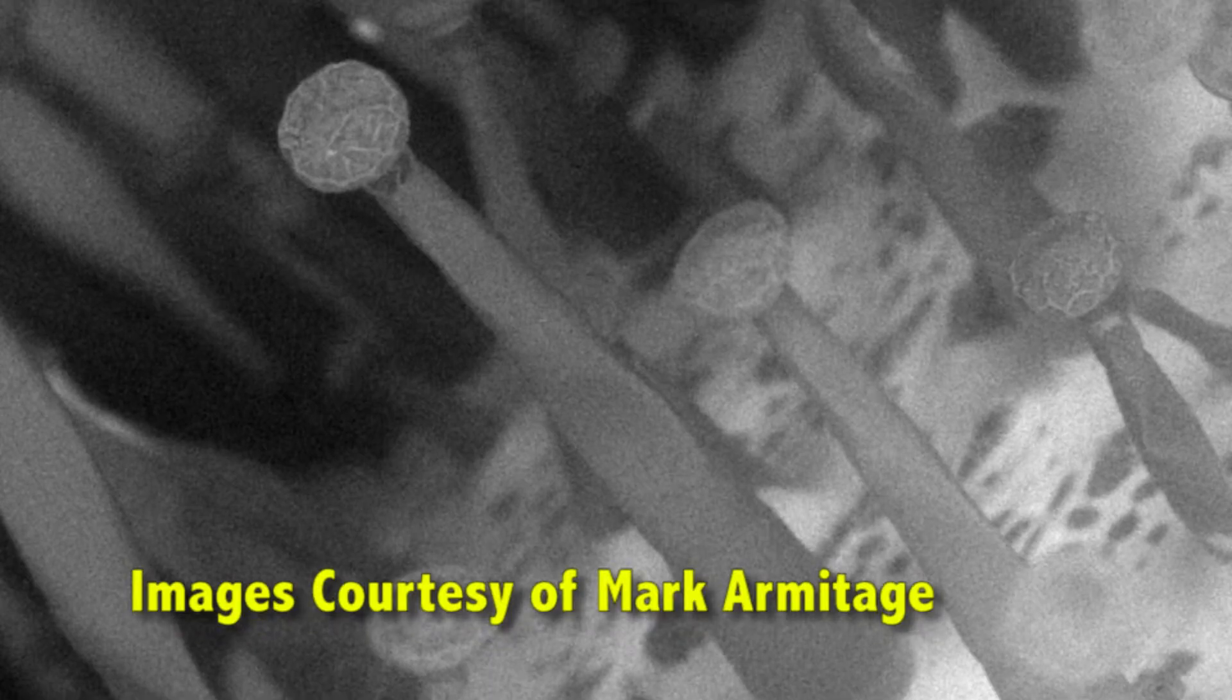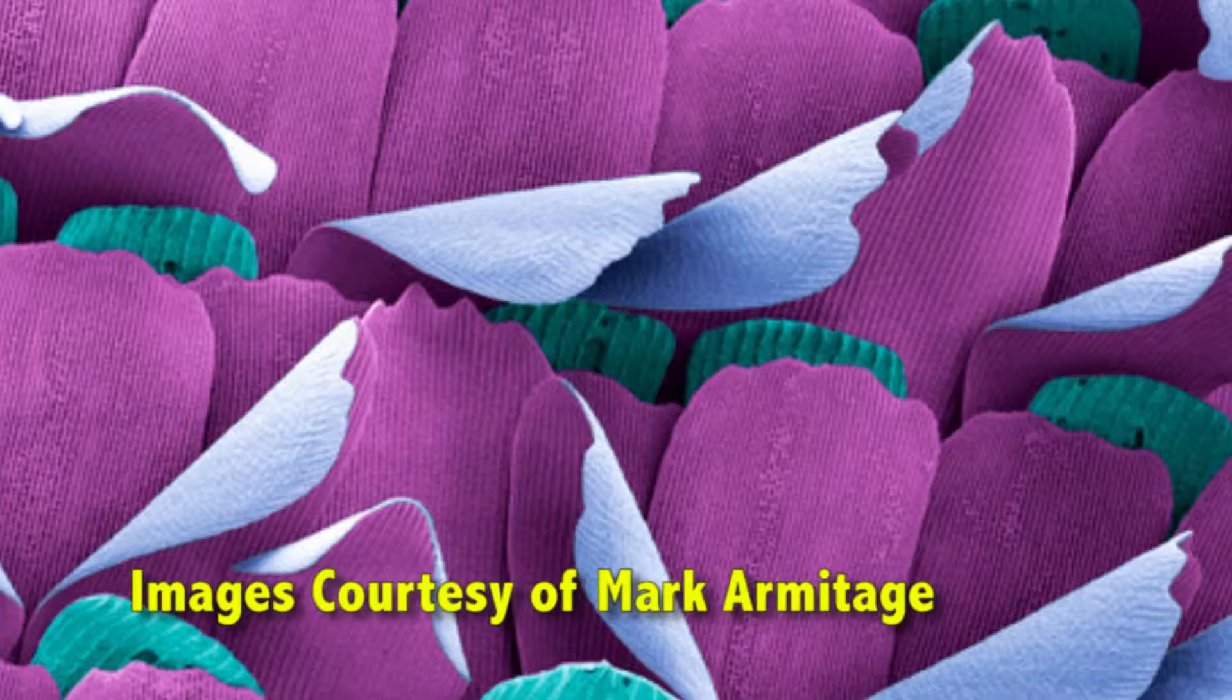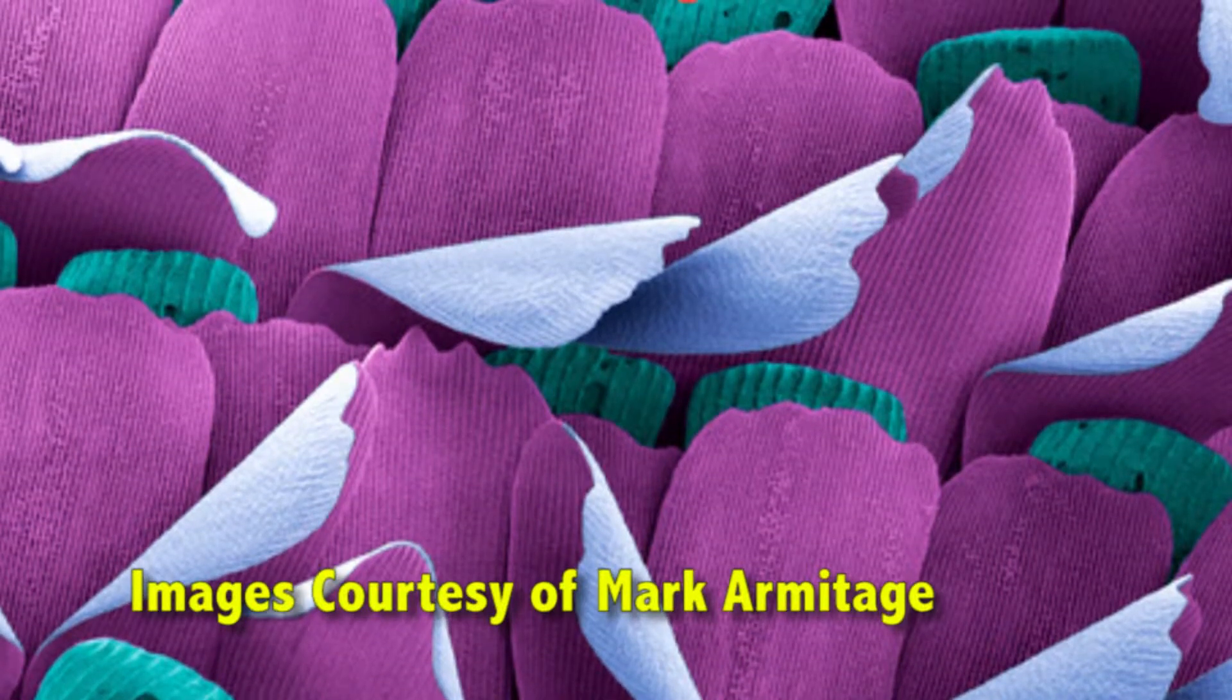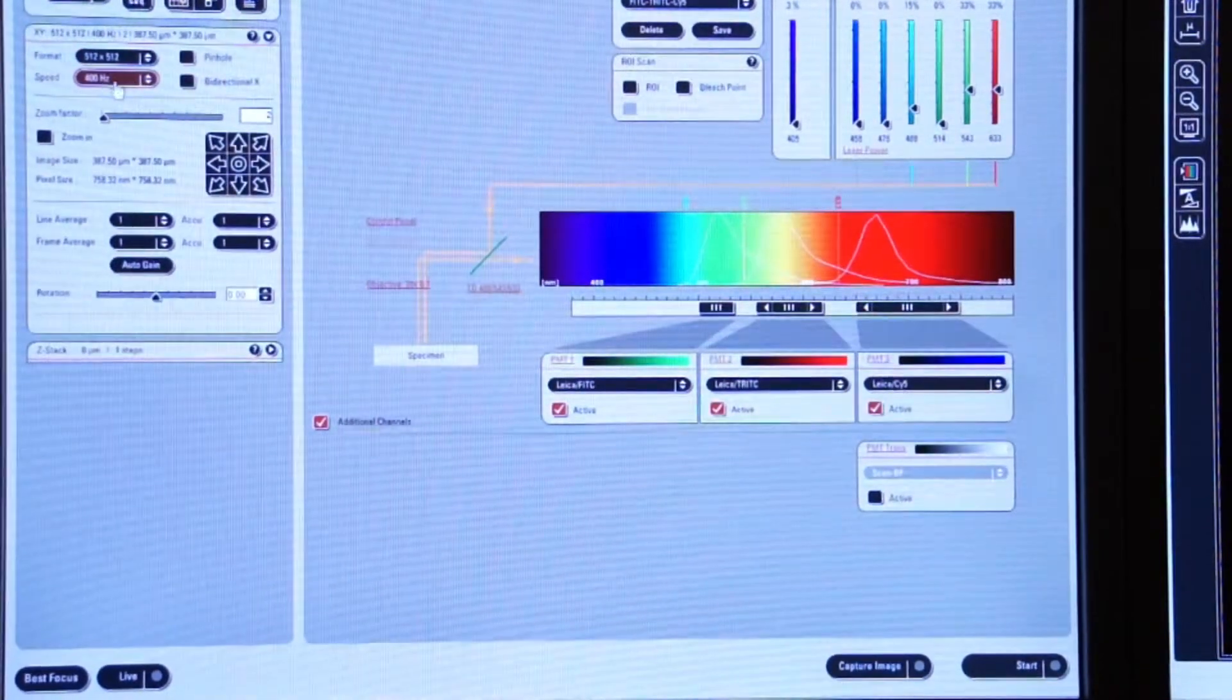Let's discuss improving the quality of our image and trying to get the highest resolution, least noisy image possible. We'll begin with 512 by 512 as you see here on our resolution.